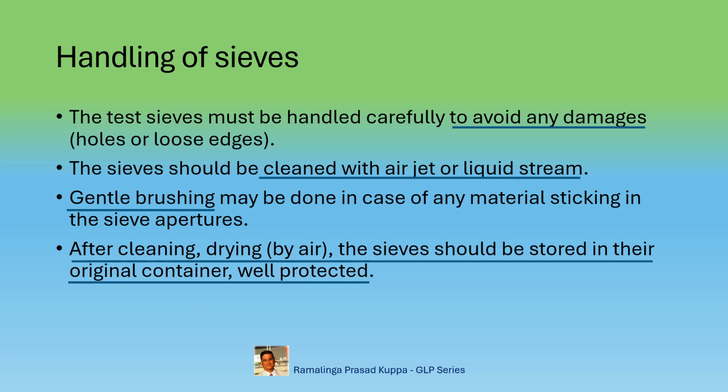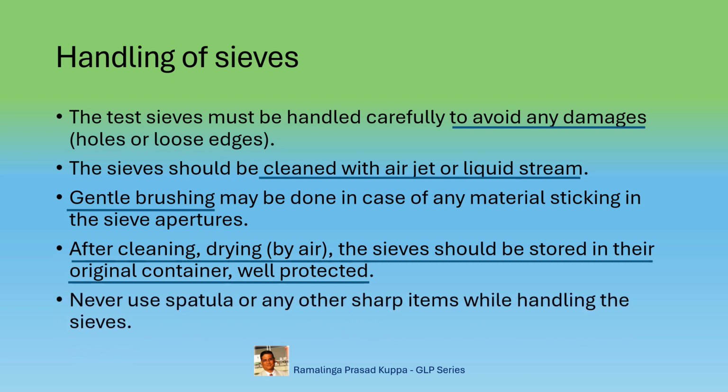The sieves should not be hit hard or dropped on the floor. Never use a spatula or any other sharp items while handling the sieves. These kinds of sharp items would have an abrasive effect on the sieves, leading to damage.